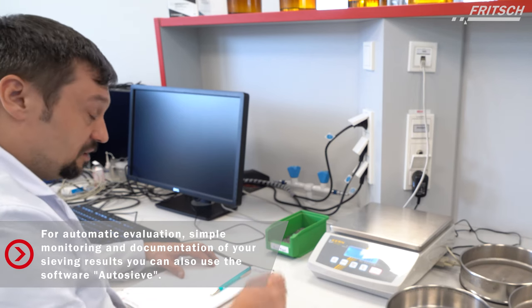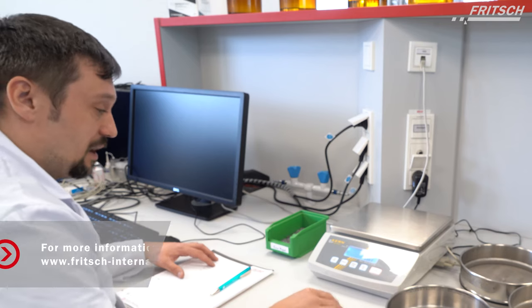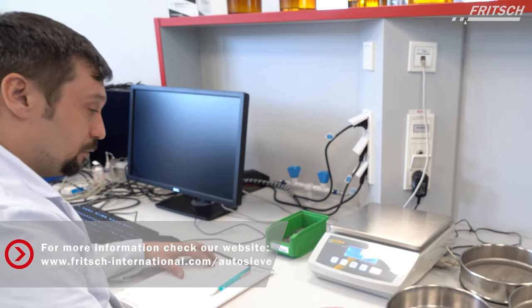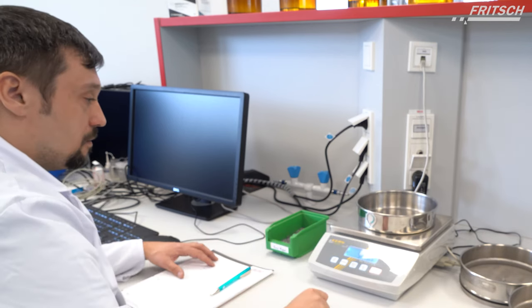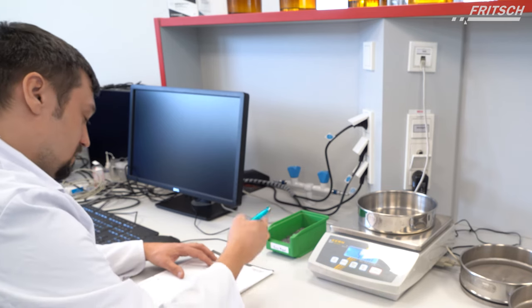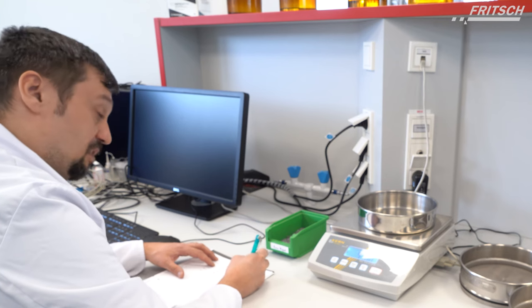For analyzing the sample later after the sieving procedure, it is important to note the empty weights of the pan and the whole sieves. We put the pan on the balance and note the empty weight.